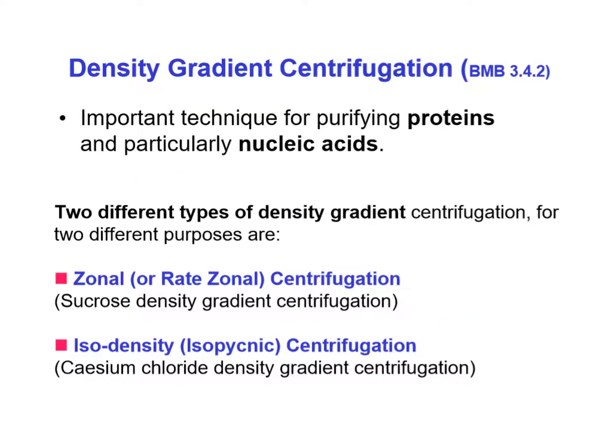Differential here seems like the easiest for students to get, right? You just take the supernatant and apply more force and time, and you get things pelleted. Take the supernatant, more force, more time. Okay.